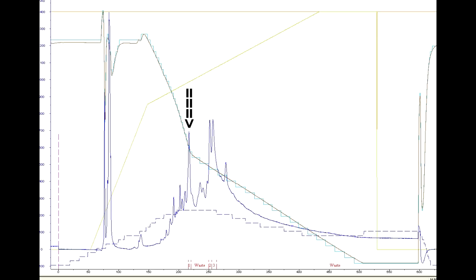And so the rest of those peaks are now going to the waste until we saw another big peak come out, which is the second peak. We inserted a 10 again and pressed execute, and so the second fraction was being collected.